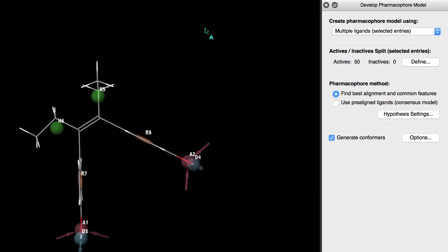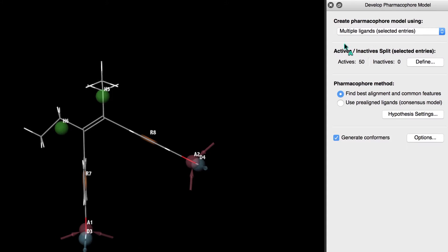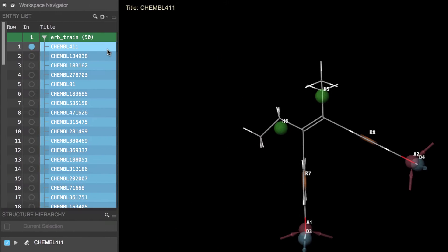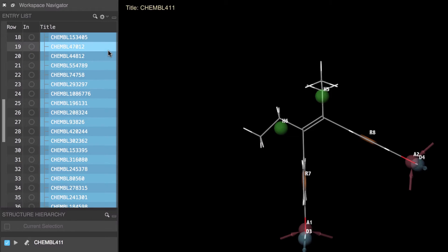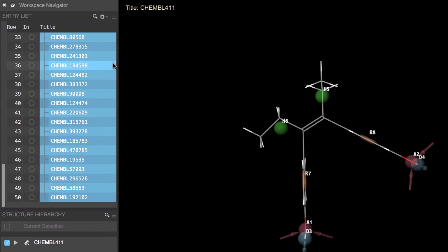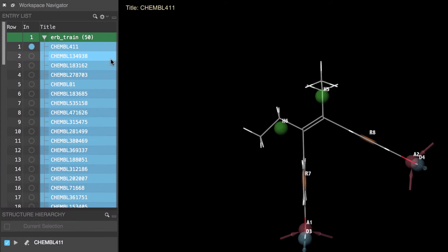Since we have a collection of multiple ligands we'll leave the create pharmacophore model using as set to multiple ligands selected entries and we'll make sure that all our ligands are indeed selected in the entry list or project table.